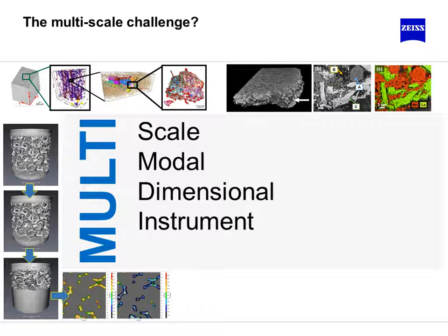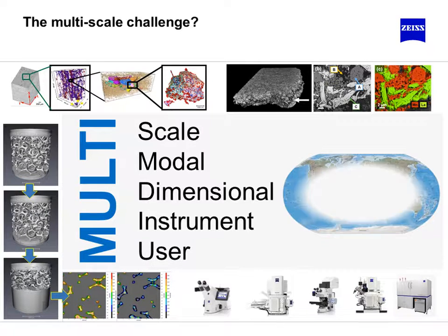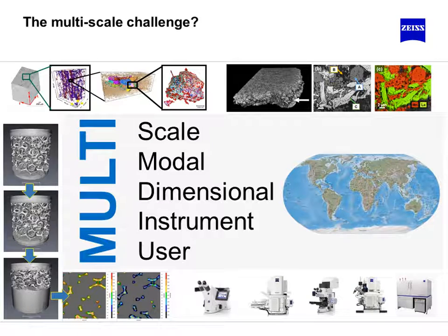And then, of course, some of the practical considerations here is that obviously no single instrument is magical and able to cover all these scales and modalities and dimensions. We have to plan strategies and approaches also for performing that, which are oftentimes run by different users, both on campus or in the laboratory, but also your collaborators around the world.